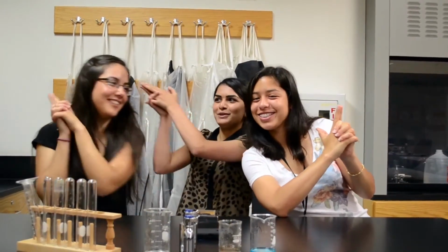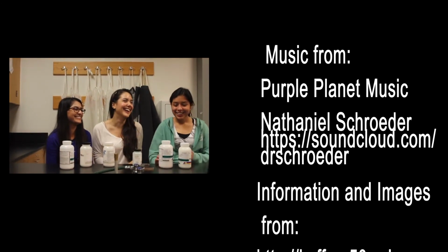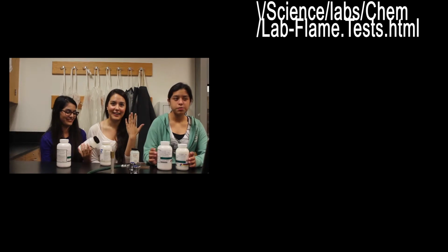Here are the science devils reporting live from Mr. Gom's lab. Karina is the leader devil. No, it's Amalia. You know I don't do anything fast. Oh, bazooka! This is awkward. Bazooka. If these were real guns, they would have died. You're gonna want to take cupric chloride, and you're gonna have these amazing Beyonce type meals. Beyonce? Of course, I'm not taking the vitamin right now, but if I was. This is a really good hair conditioner.